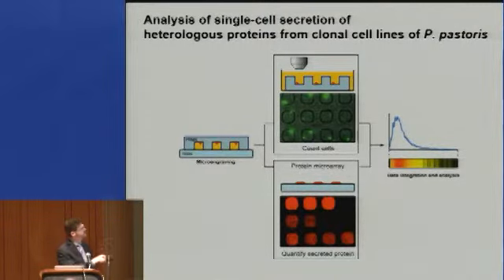This integration of data for the single cell gives us the opportunity to really ask questions about how different phenotypic traits are related at the individual cell level. What we can then do is integrate those data. And this is an example of the integration of the rates of secretion for single cells counted on the array, represented now as a heat map in a histogram format so that you can see where the median rates lie.